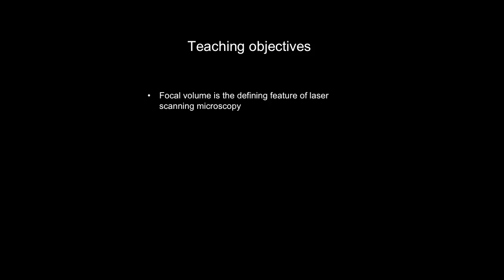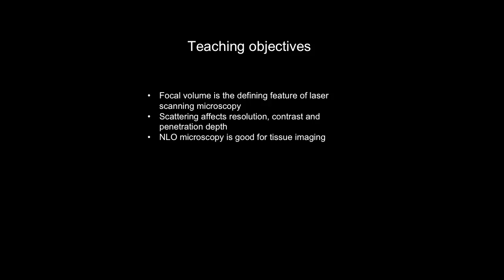And then I'll finish by summarizing our teaching objectives. We learned about the focal volume, that it's the defining feature in laser scanning microscopy. We learned how scattering affects the resolution, the contrast, and the penetration depth. We learned, hopefully, that nonlinear optical microscopy is good for tissue imaging. I'm sorry I didn't get to show you the most complex nonlinear optical signal, which is the Raman signal, but I'll tell you about it when you visit our lab. And thank you very much.